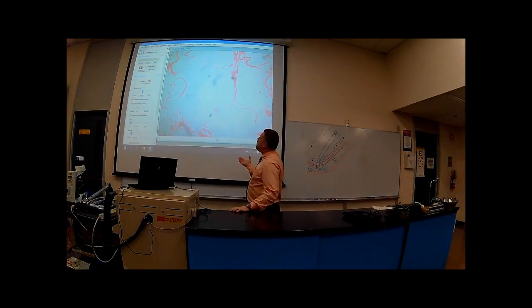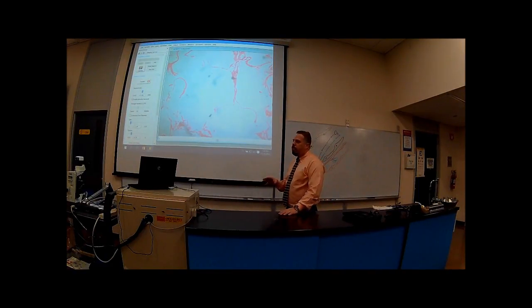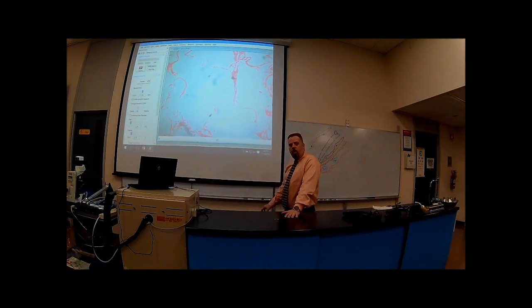That's at 40x. Before, about how many alveoli did you see in a normal lung with 40x? 50, maybe 60 different alveoli? But look at this, at the same magnification, at low magnification of 40x, what you're seeing here is maybe one alveolus here, another one over here, another one over here. I mean, you can really count these. There's maybe about 4 or 5 alveoli in one field of view. This is where the alveoli are overly stretched and filled with air, right? Oxygen. What do you think this is? Right, emphysema, okay?